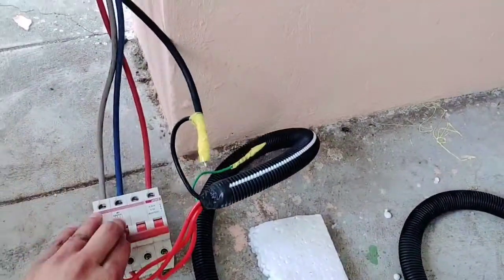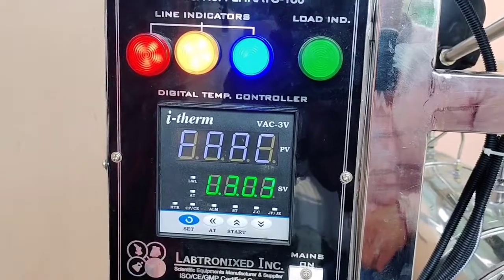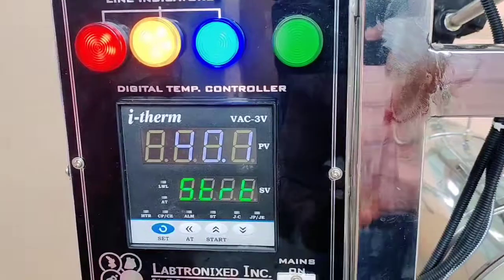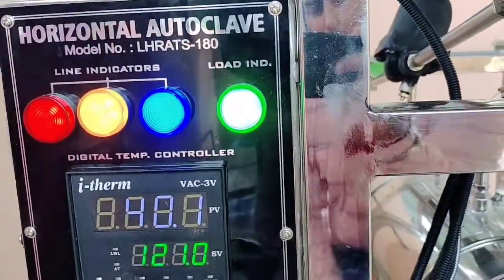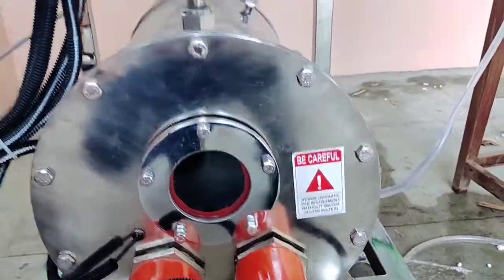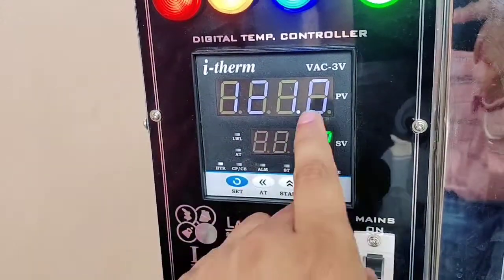Now we want to start the machine and turn on the MCB. Now lighting is coming and main switch is on. If you don't need to change the program, only press the start button for a few seconds. Now our heating indicator is on and machine is working and steam is generating in the boiler, then transfer to the jacket. If you want to change the program, you can press the set button — this is where you can change the temperature, like this, up and down.